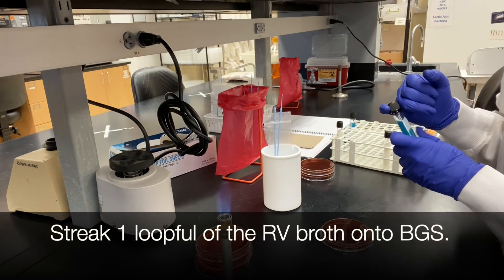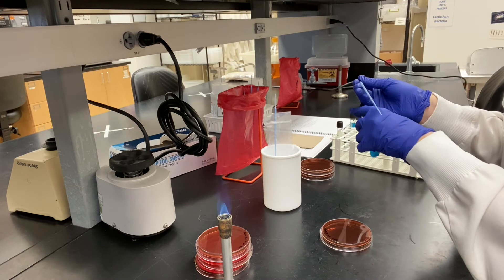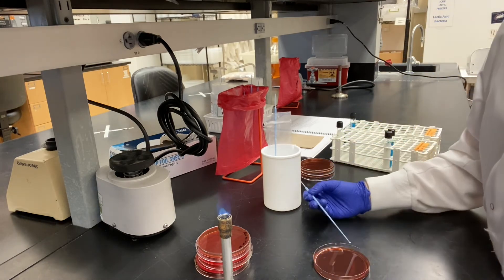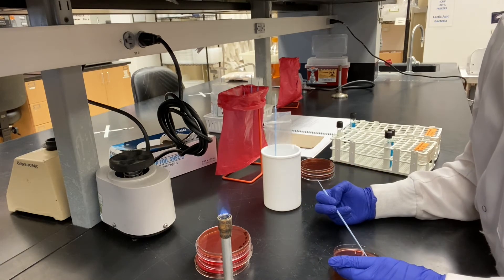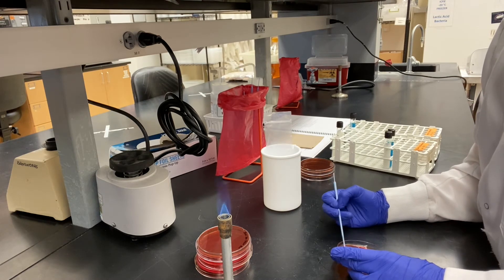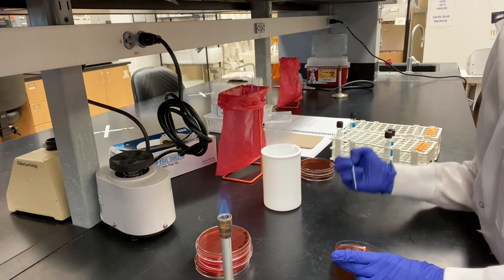Streak one loopful of the RV broth onto BGS agar. Incubate your plates at 37 degrees Celsius for 24 hours.